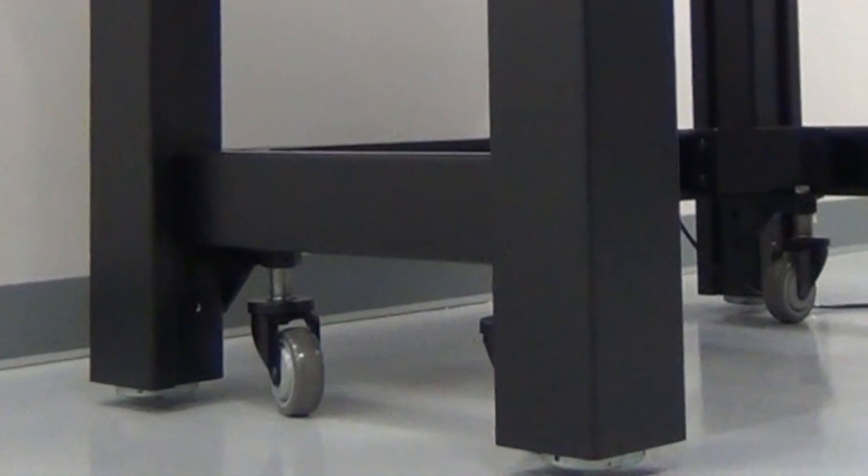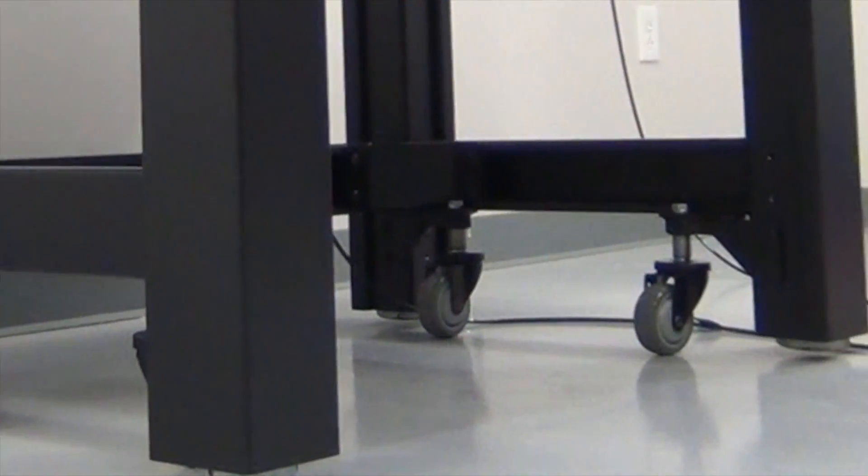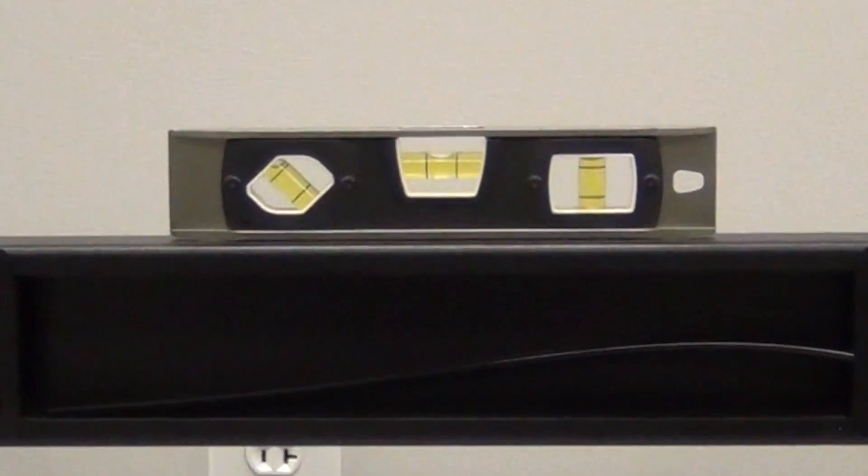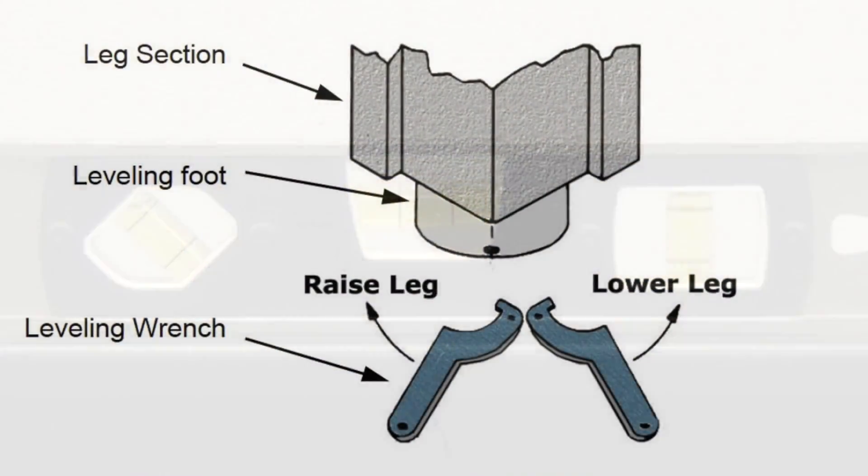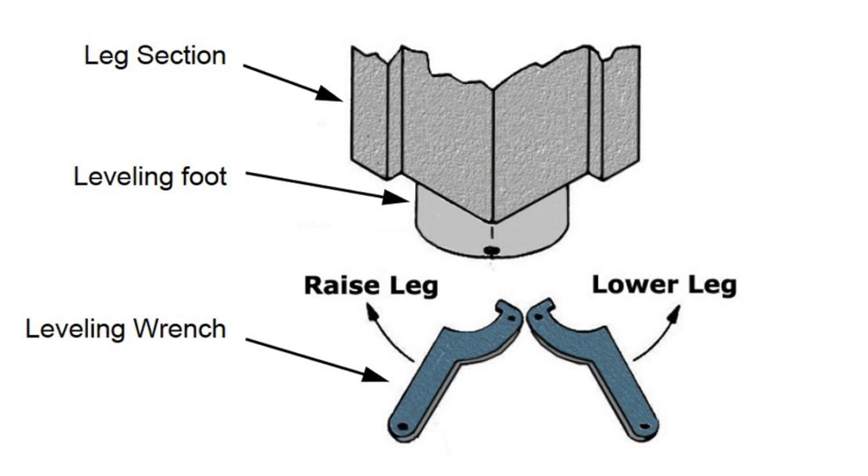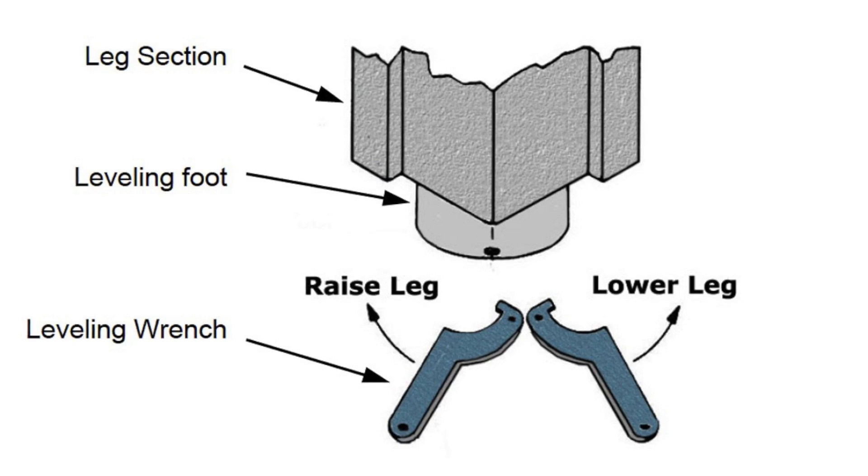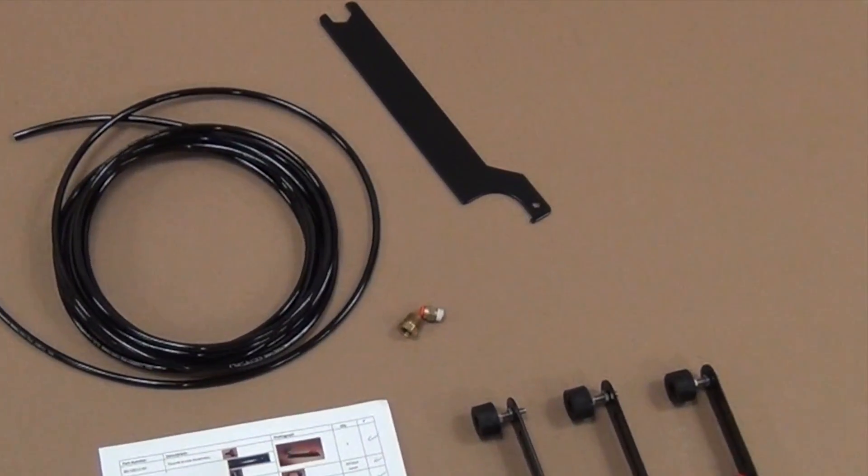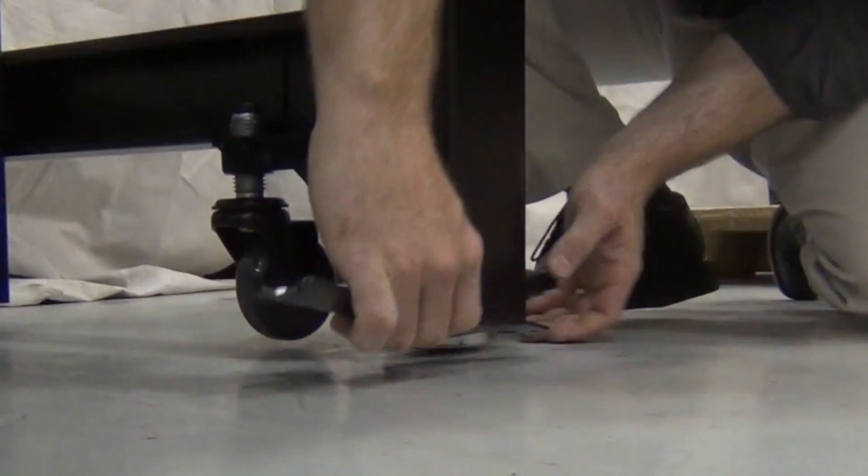With the frame positioned, the leveling foot on the bottom of each leg can be adjusted and the frame leveled using a carpenter's level. The leveling foot has dimples which can be turned using the spanner wrench provided in the hardware bag. The leveling foot is shipped in the middle of its five-eighth inch total throw.